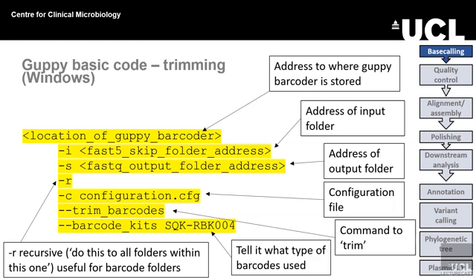So if you don't tell it exactly which kit to use, it just goes through all of your data and checks for barcodes. And obviously it's inevitably going to find those small bits of code within your actual genome. So if you don't tell it which kit you use, it will output to 96 different files. So I thoroughly recommend not doing that.